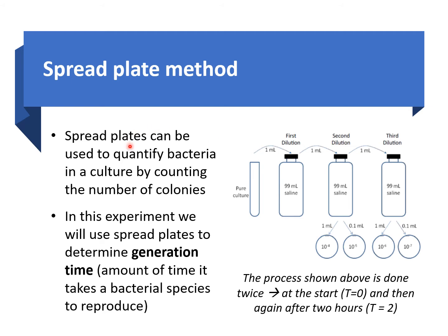So spread plates, as I said, we use so that we can quantify our bacteria in a culture. We count the number of colonies, and based on the number of colonies, you do some math and you can tell exactly how much bacteria you have in your sample.